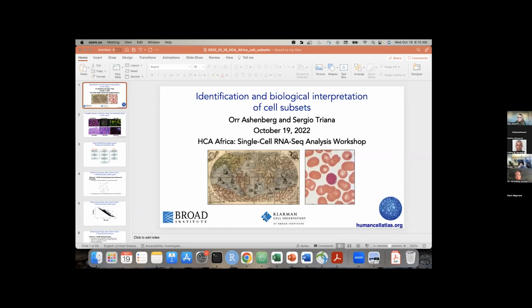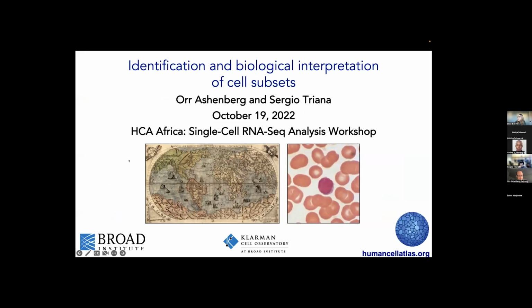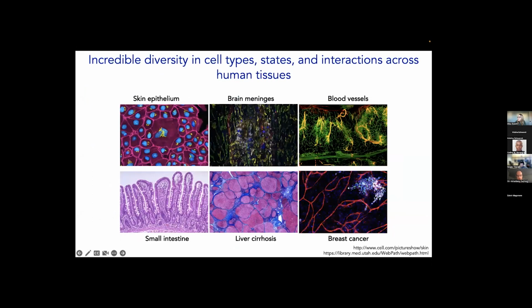So today, Sergio and I are going to walk you through really the central part of single cell analysis, which is identifying the cell subsets. So first, let's just start by remembering what cell types are and what they look like.